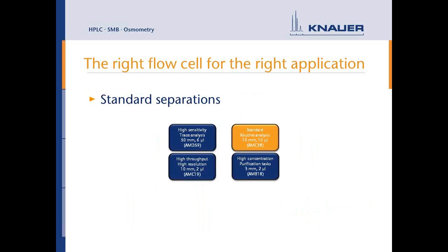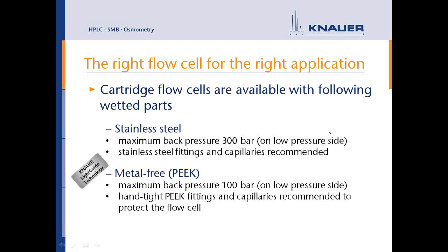Maybe Kate, you can tell us something more about these configurations? Yeah, well, you notice that in the slides that I showed previously, this particular slide with the standard flow cell and the one that we're going to explain a little bit later had a nice little orange "coming soon" sign. That is true. They are not yet officially released, but we can still use these flow cells when we use the fiber optics adapter. So it is really worth still looking at these flow cells.